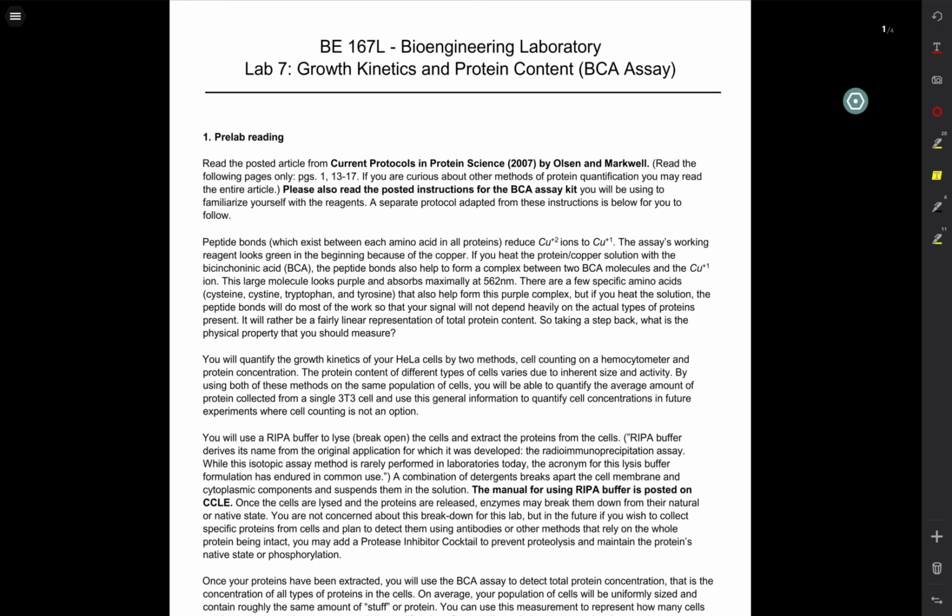Hi everyone. Today I'm going to be going over Lab 7, growth kinetics and protein content via the BCA assay.